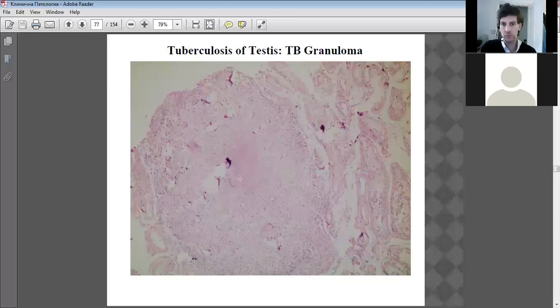Spaces start to form, and the disruption to the tubular network within the testis on the border of the granuloma. These are still normally dividing, so meiosis is occurring normally there to produce the haploid spermatozoa.